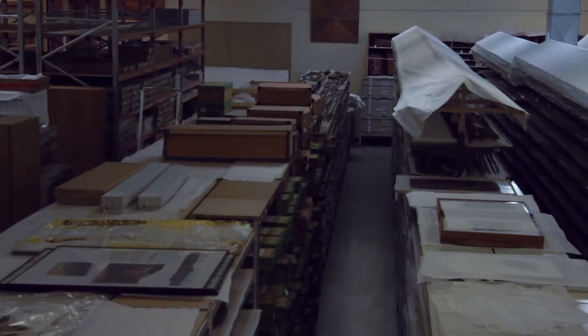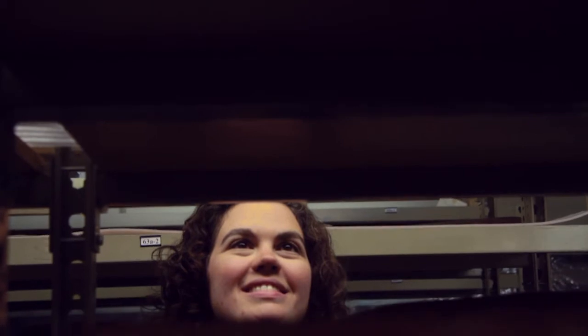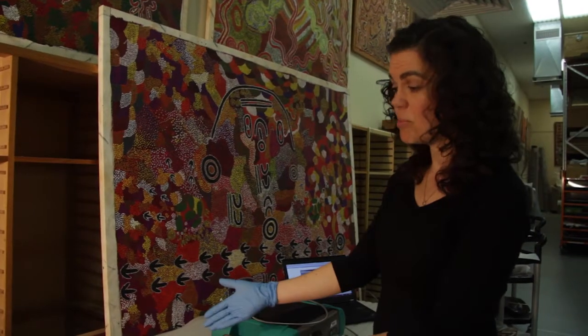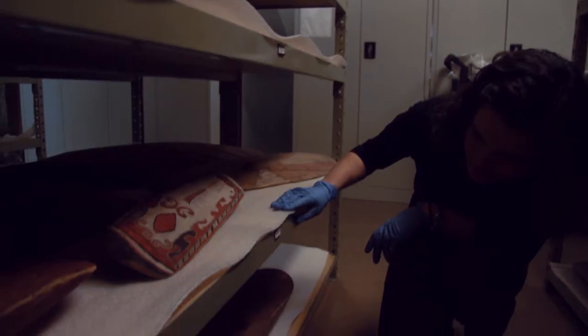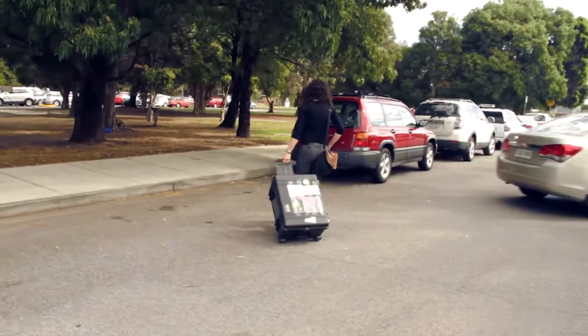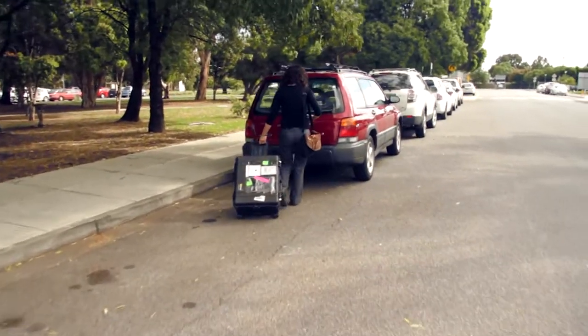Now, in a world first, Dr. Popelka-Filkov and colleagues from the South Australian Museum and the South Australian Government have adapted a system originally designed for mining applications to study the pigments using a non-destructive infrared technique. Dr. Popelka-Filkov says the research can tell investigators about the technologies and materials that Aboriginal Australians have developed over millennia and continue to use today.